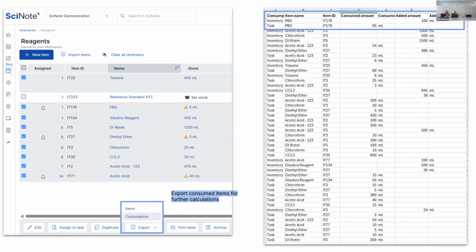Yeah, go ahead. It's very similar to before. I am obviously a stickler for processes and procedures. But I would really emphasize that one way things get missed is if you don't have a systematic approach of logging items in the inventory, whichever kind of inventory you have.